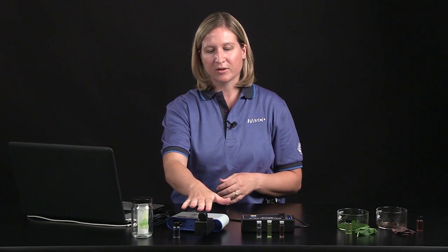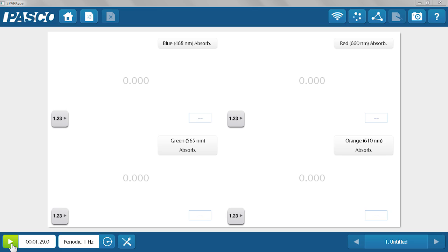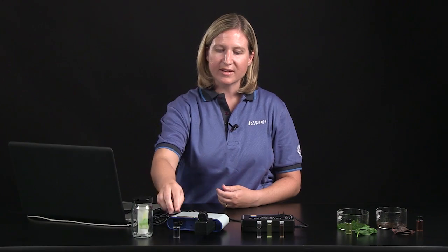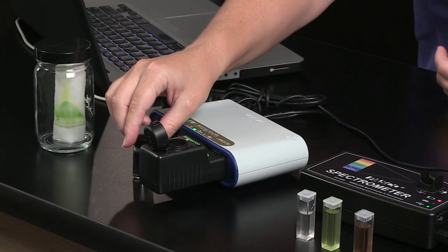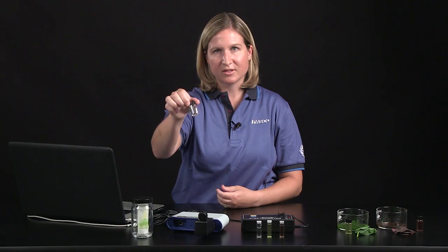First I'm going to start with the colorimeter. I have a colorimeter and a SparkLink Air attached to my computer, and I'm going to show you the data in SparkView. I've already calibrated the colorimeter — it's a simple green button calibration on the front of the sensor. I used a cuvette of ethanol as my blank, because that's the substance I extracted the pigments from.